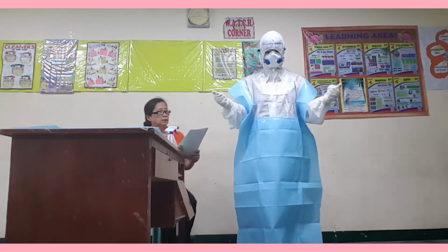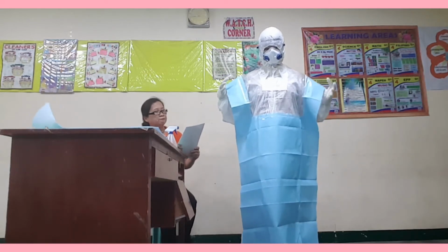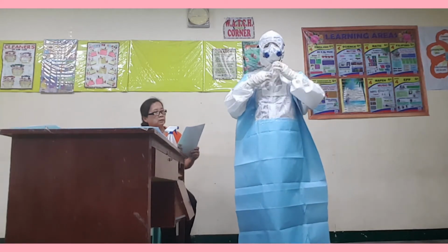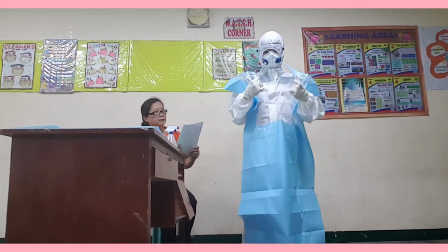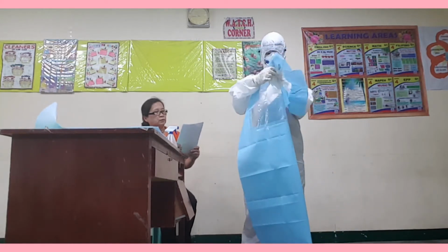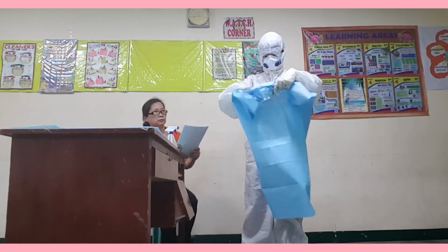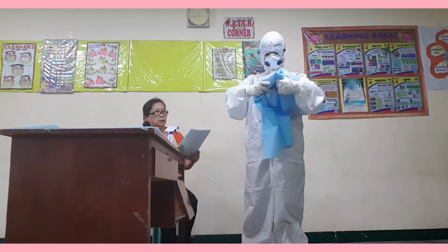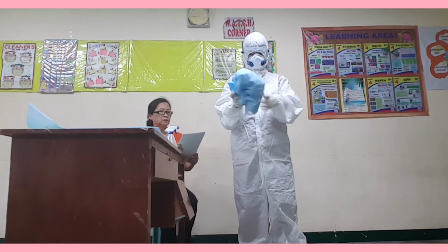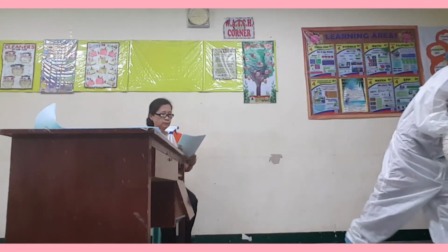Procedure number 3, remove apron. Break the apron by pulling from the neck. Avoid contaminating gloves by rolling the apron from inside out. Discard the apron. Removing the gown or apron as described prevents contact with the contaminated front of the gown.